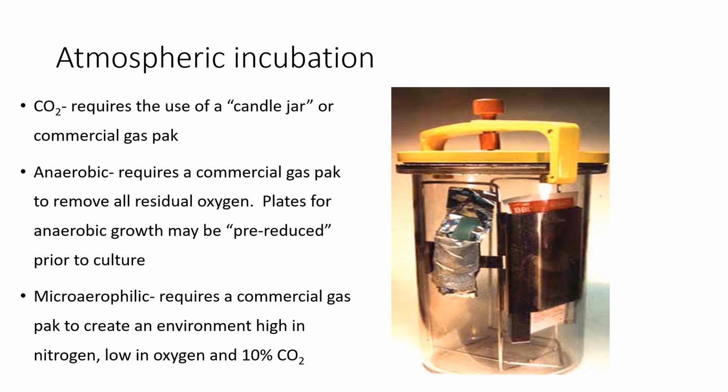Then finally, for our last slide, you might be asking, well, how do we get those atmospheres? How do we create those atmospheres? Okay, some incubators are aerobic incubators, and other incubators actually have canisters of CO2 attached to them. But in our student laboratory, you can actually create those environments by using a jar, okay? And these jars can be made to contain carbon dioxide, or they can be made to extinguish oxygen, or they can be made to increase nitrogen.